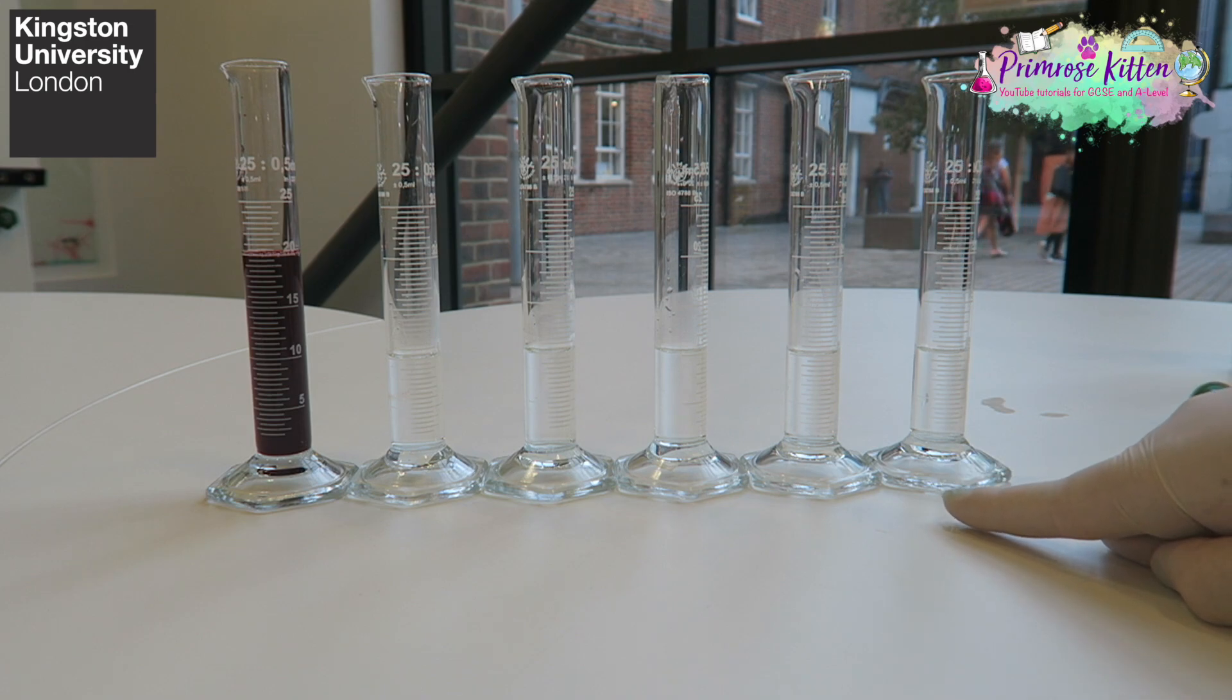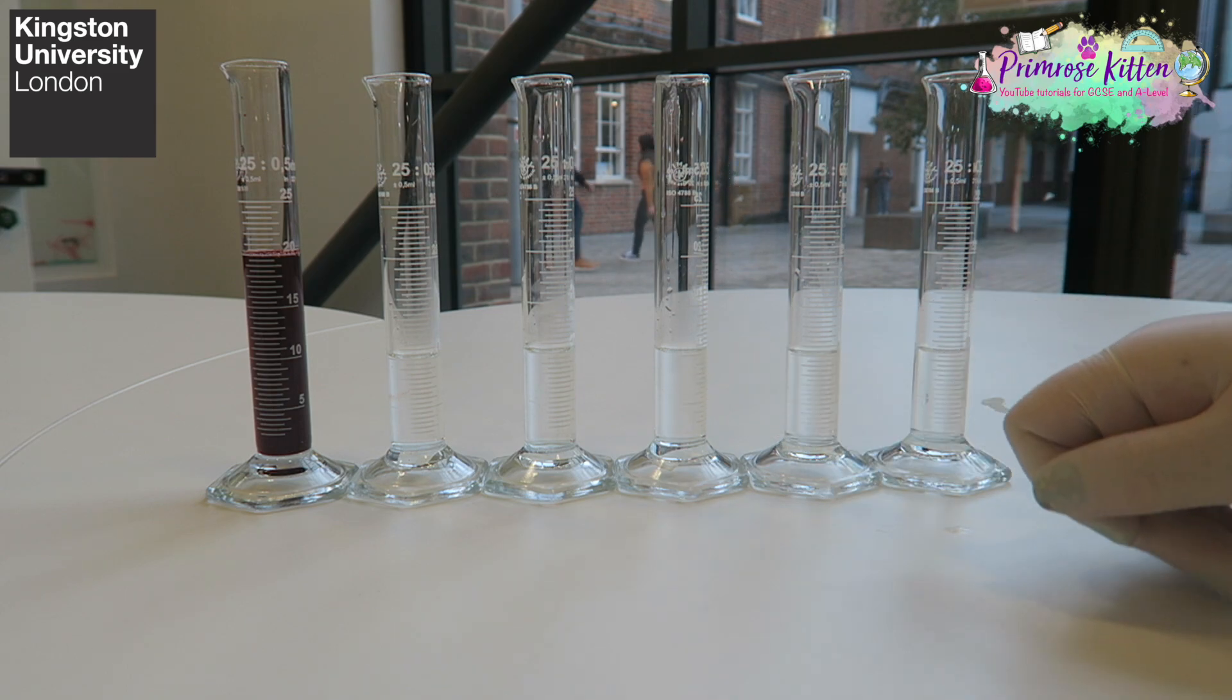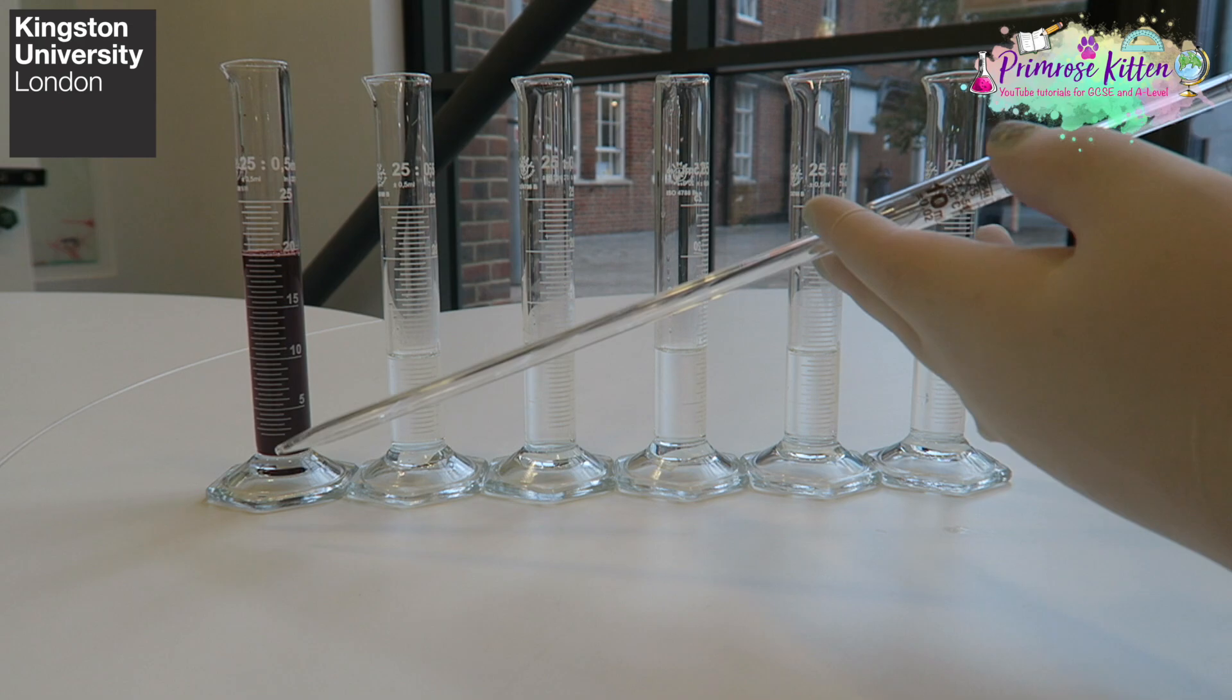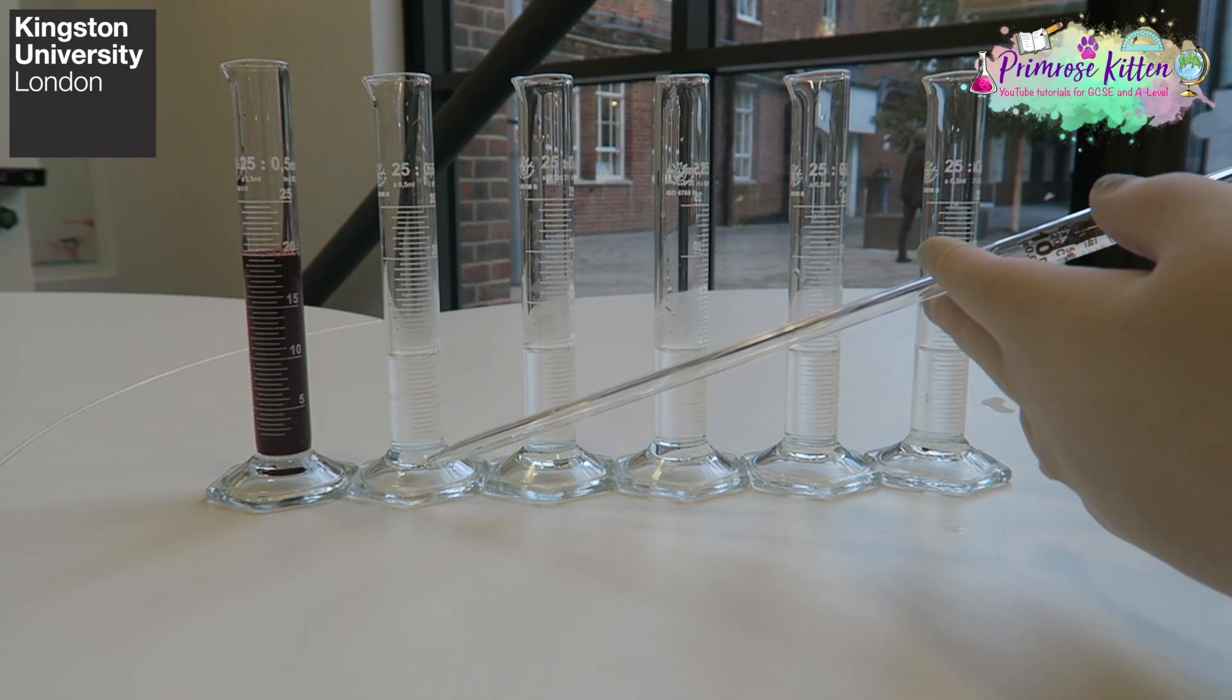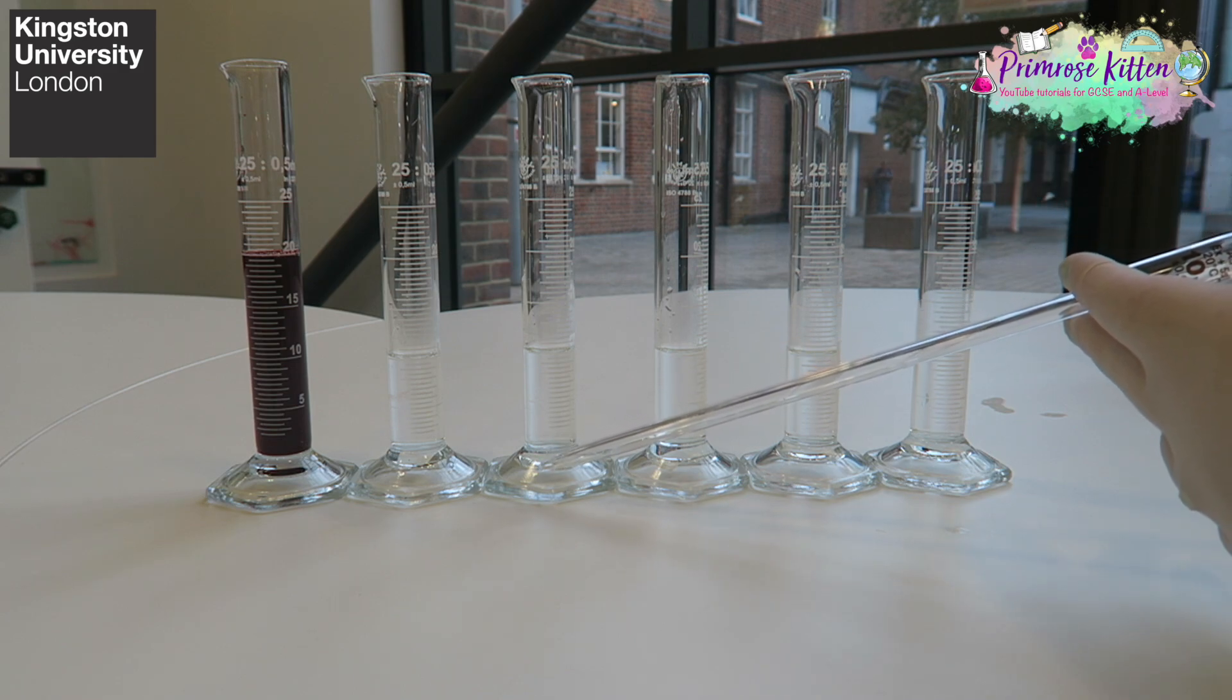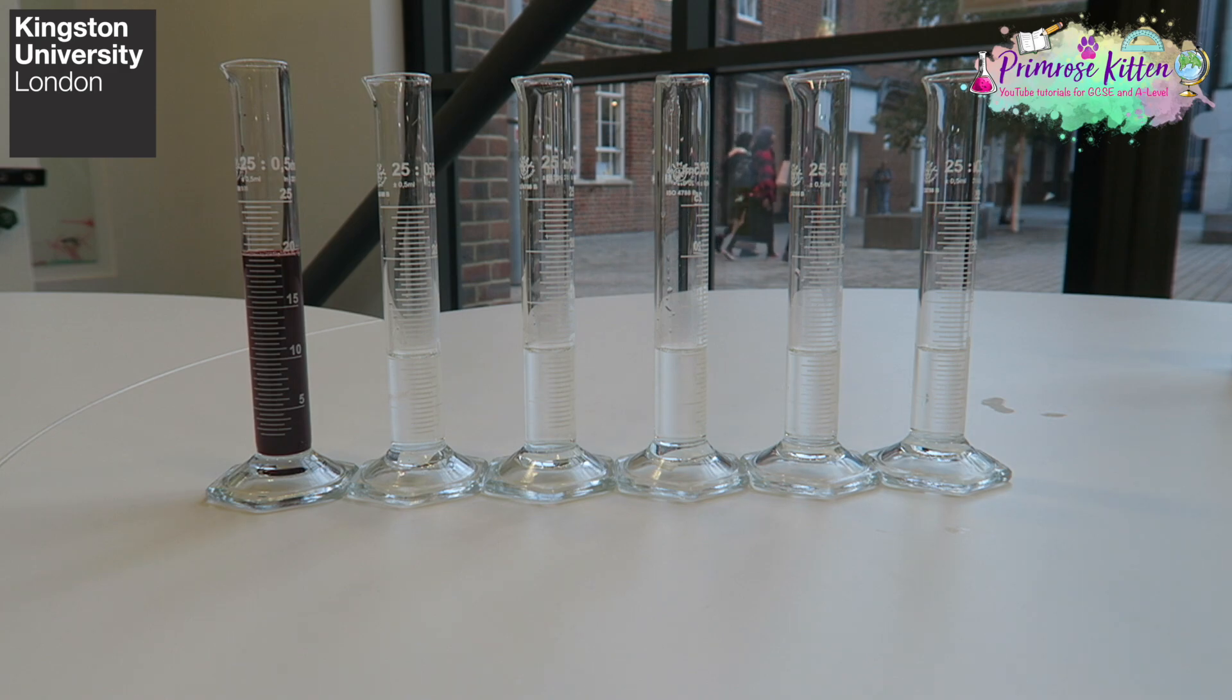There's 10 centimeters cubed of distilled water in each of these up to the line with the bottom of the meniscus. I'm then going to use a pipette to take 10 centimeters cubed from here, put it into here, mix it. 10 centimeters cubed from here, into here, mix it. 10 centimeters cubed from here, into here, mix it. So we're going down. The concentration is going down by half every single time.